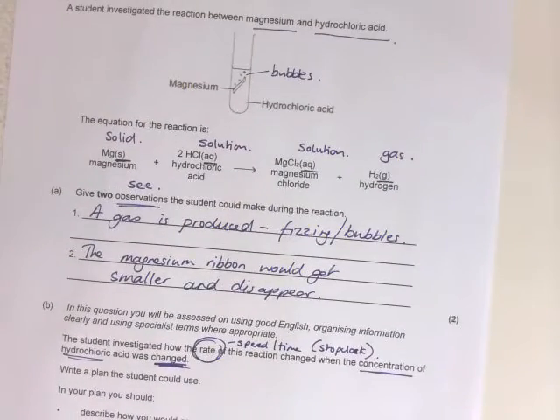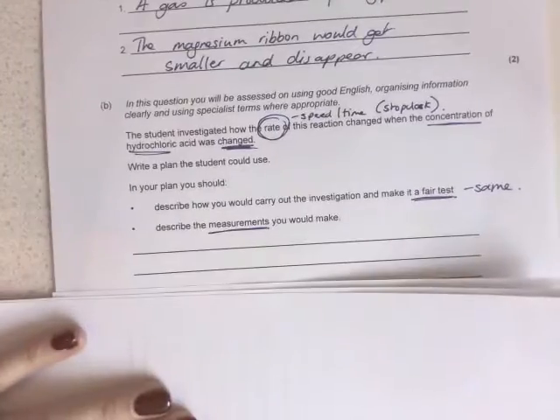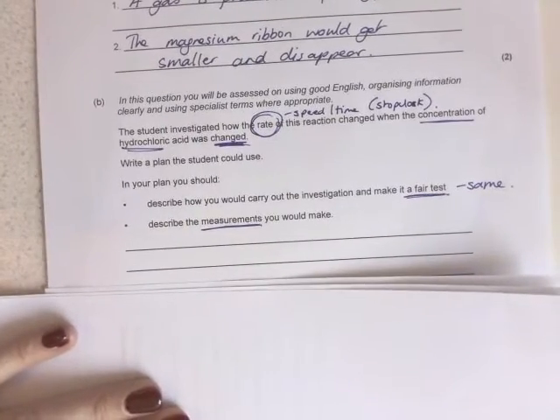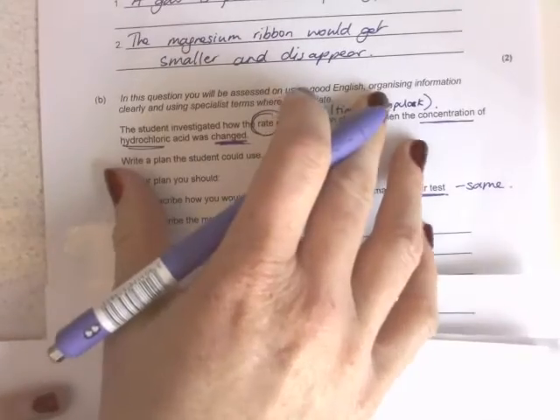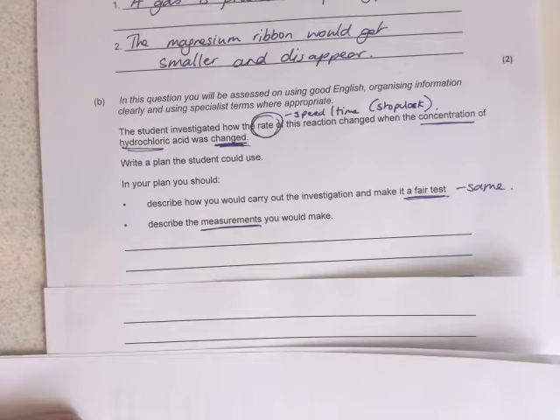Now we've got our clue from the observations that we could see. There are 2 things there that I could measure, right? That is what I'm going to be thinking of when I'm writing this plan. In terms of keeping the same, I'm only going to change the concentration of the acid.